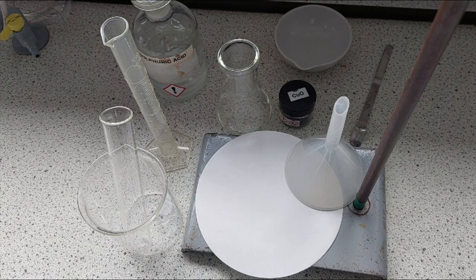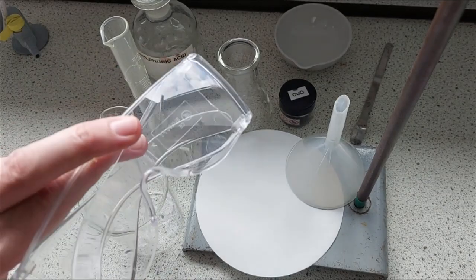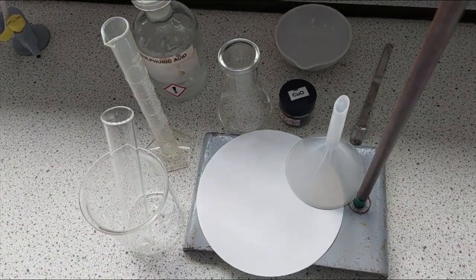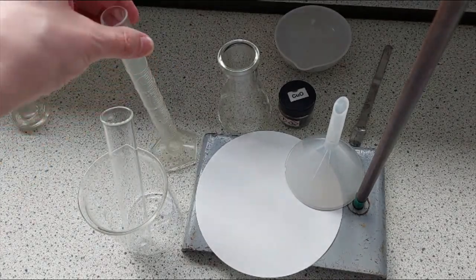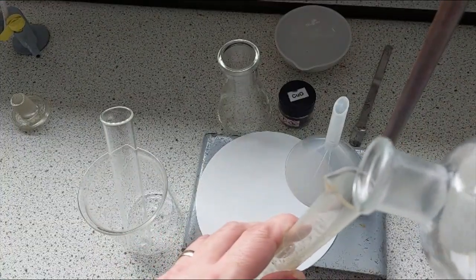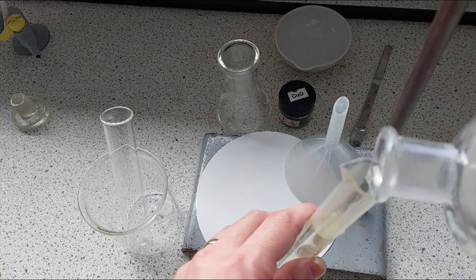So what we're going to do first is react the sulfuric acid with the copper oxide. Now obviously we're dealing with an acid, so while I'm doing this I will be wearing a pair of stylish goggles. What I'm going to do is measure out 25 milliliters of sulfuric acid. Now this is an irritant. It's not a concentration that is going to burn holes in me, but it is an irritant. If it were to get on my skin, it would cause an itchy rash. If it got on my eyes, obviously it would cause a lot of harm.